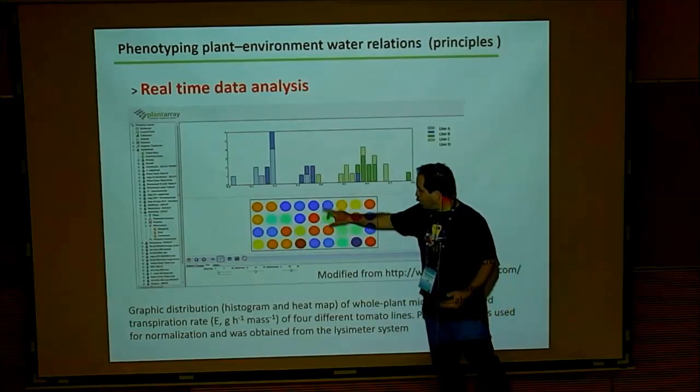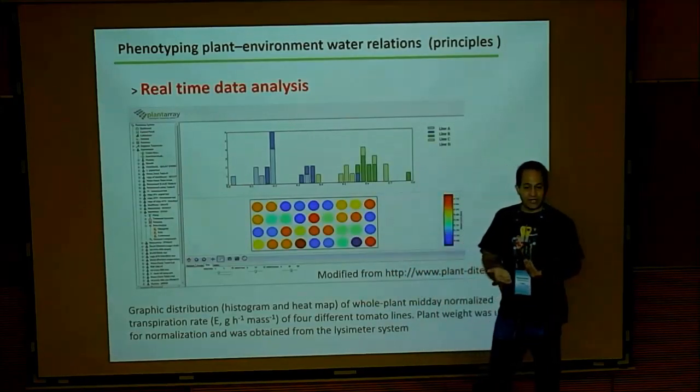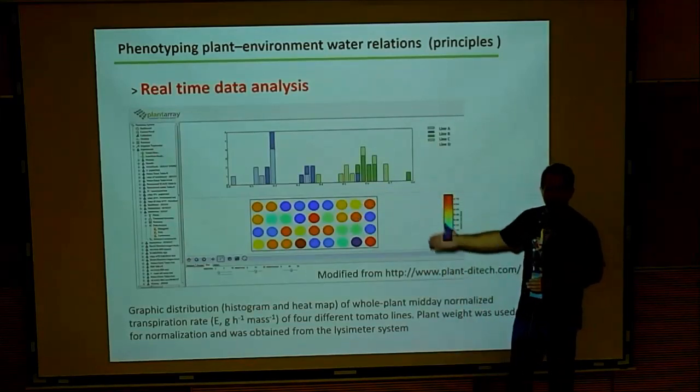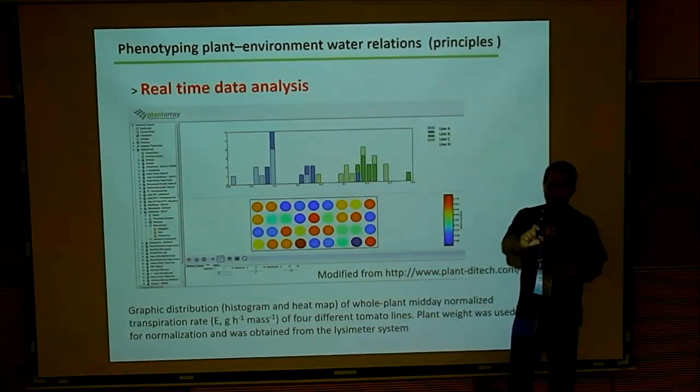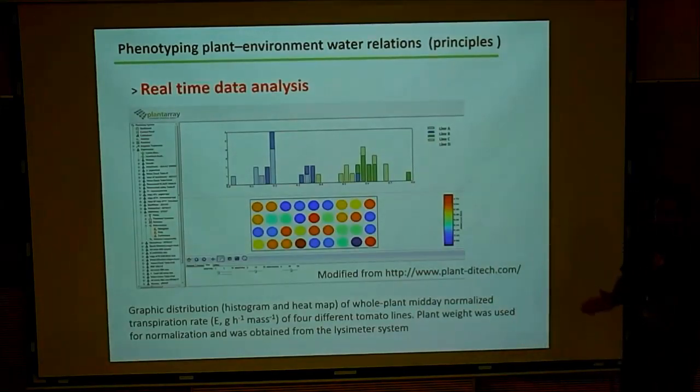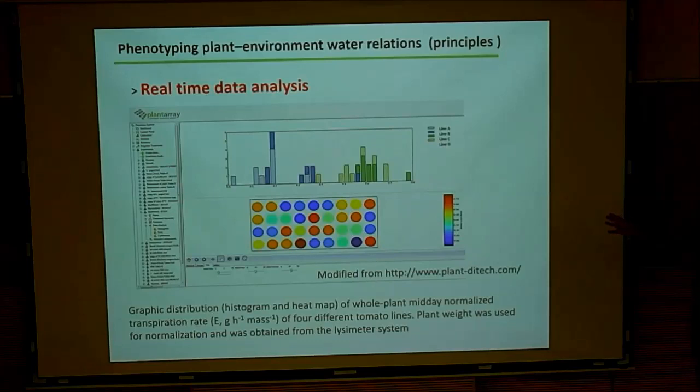We have always a report on our plant's behavior, and we can very fast select our plant. So while one experiment is running, we already see the next one. So in 3 months, we can push 2 experiments because the average time we use for experiments is about 4 to 6 weeks. Okay, we usually go to flowering a bit later and then take it off and bring the new one. If we want to go to yield, usually we take the plants and put them in other places because we want to save the time on the system.